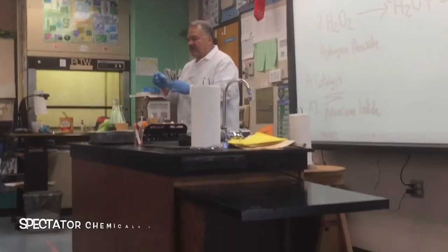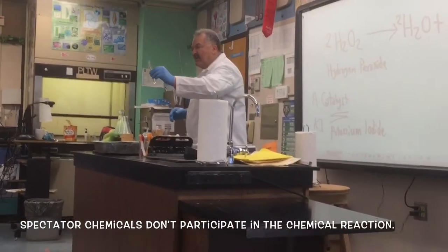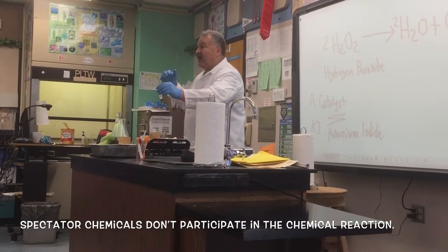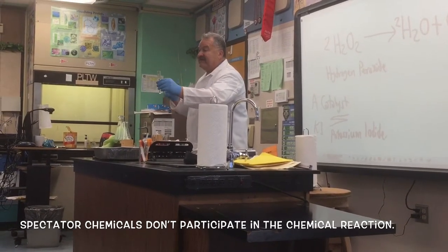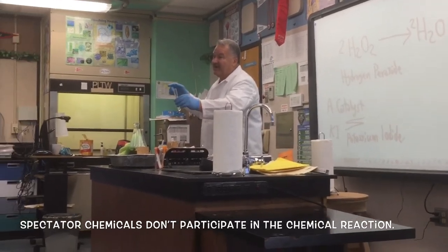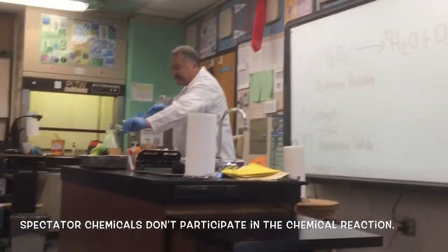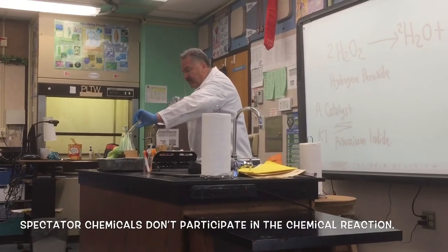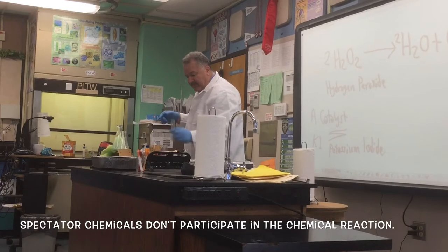All right, listen, all of you. Here is the hydrogen peroxide. What percentage? 30. Yeah, 30%. The one in the store, how many? Three. This is 10 times more powerful than the other one. So here it is. Let's refrain from talking. Here we go.